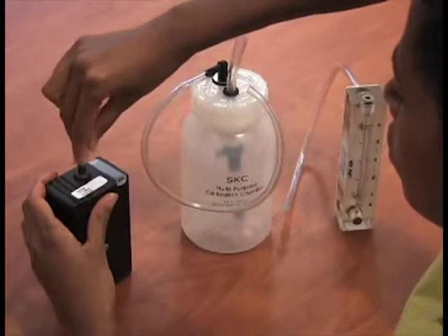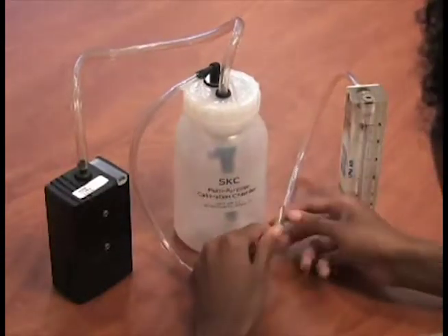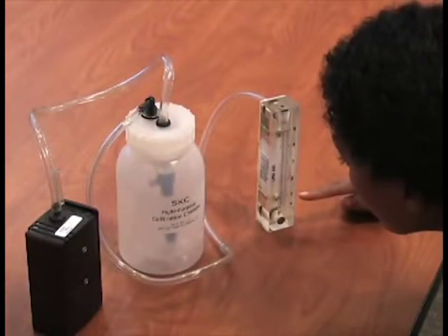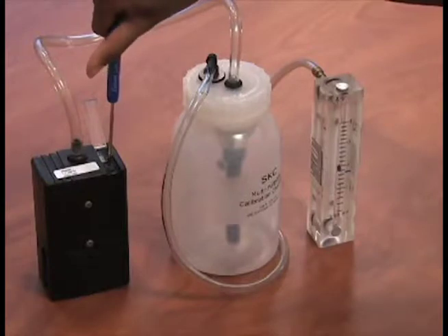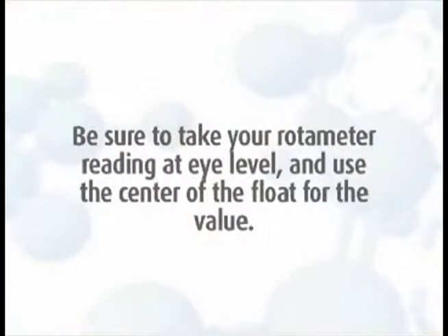Tighten the jar lid. Then connect the tubing on the outlet of the sample jar to the sample pump tubing. Connect the inlet tubing from the jar to the rotometer. Turn on the pump. With everything sitting on a level flat surface, check the ball float in the rotometer. Adjust the flow rate by turning the flow adjustment screw on the top of the pump until the rotometer indicates the desired flow. Be sure to take your rotometer reading at eye level and use the center of the float for the value.